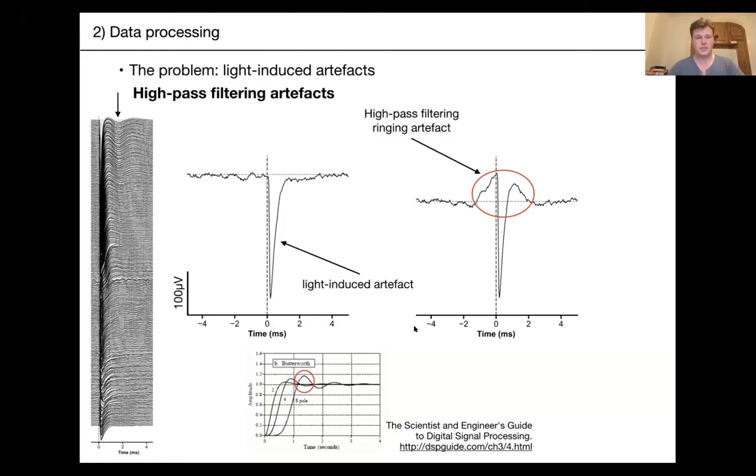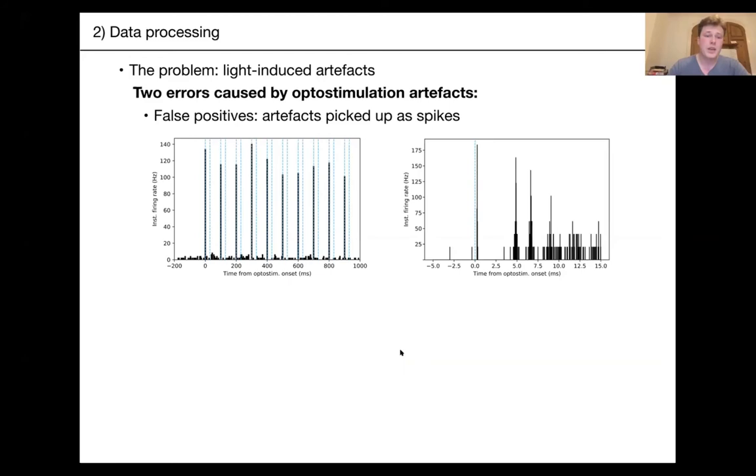So those are what the artifacts correspond to. Why is this a problem? The first risk is false positives — neurons appearing to respond to your optostimulus when they don't. Here you see a PSTH zoomed in at 15 milliseconds, with extremely precise responses to the optostimulation. This is a cluster found by Kilosort where, apart from spikes happening right after the artifact, there are otherwise acceptable spikes — which you might label as good if you're not careful.